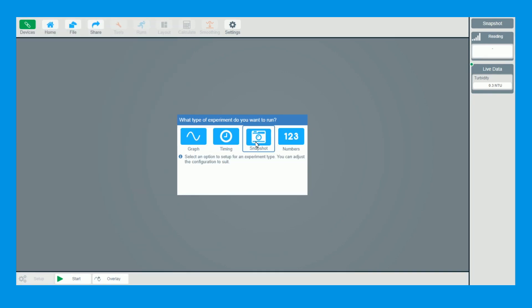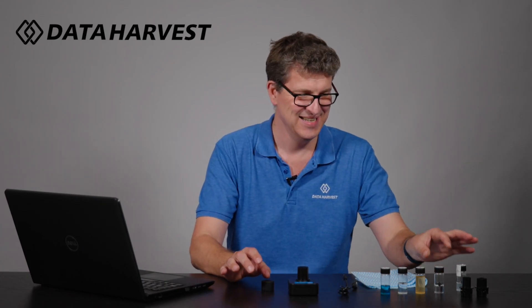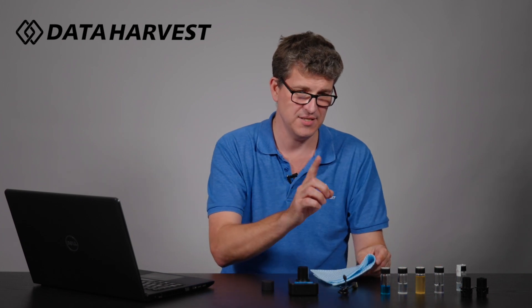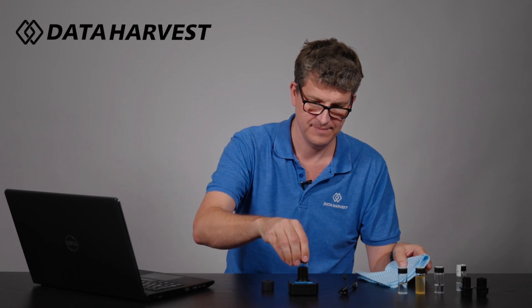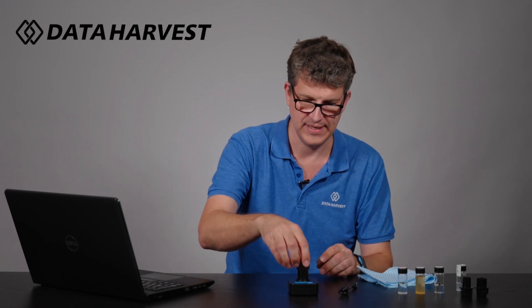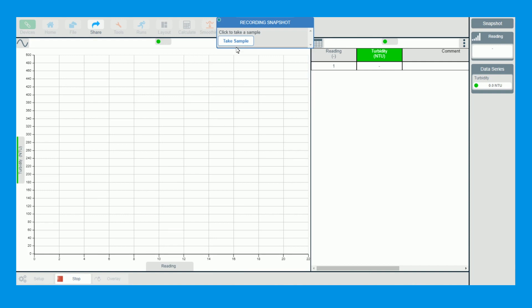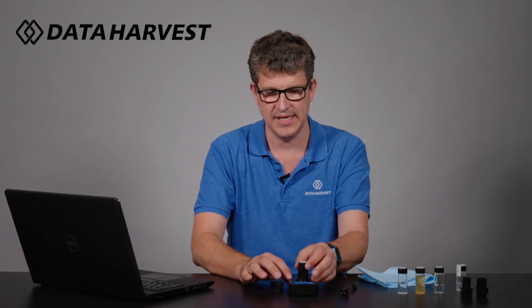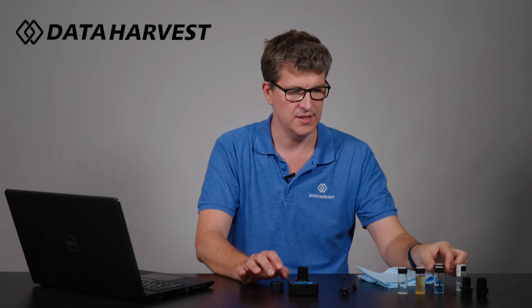Click anywhere on the screen, then click Snapshot. Now, one thing I didn't do with both of those calibration samples is wipe them with the cloth first, but the major thing is to wipe these sample vials. So I'm going to wipe around this one and pop it in. We're now going to click Start. In snapshot mode you take a reading when you want to — so you're more in control. We take the first read and we can see it's 0 NTU. Which shows that colour has no effect on turbidity.